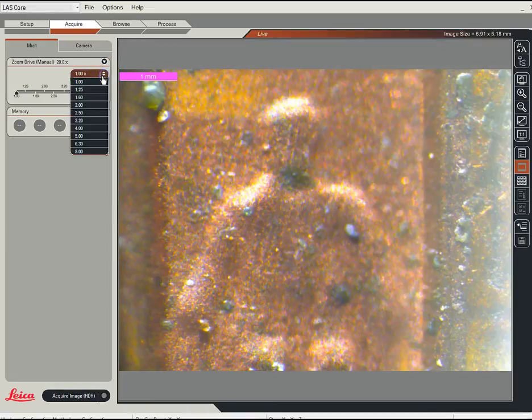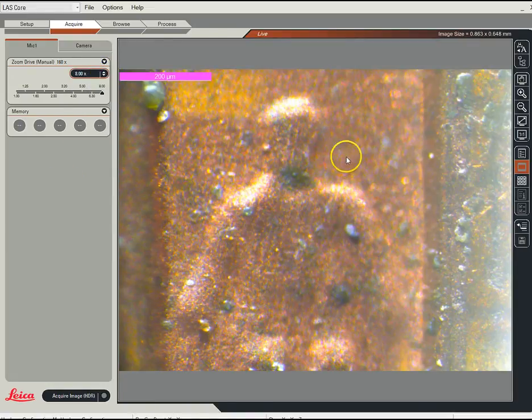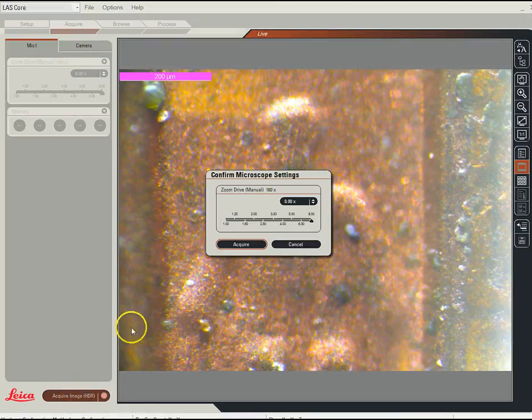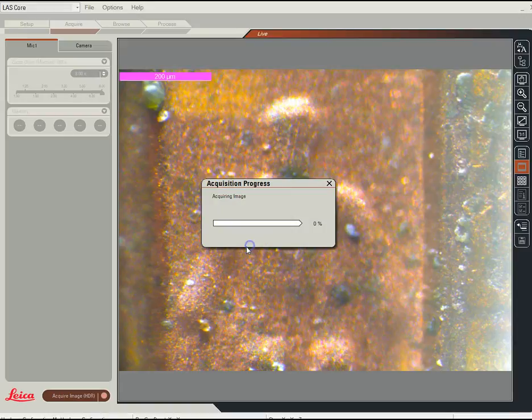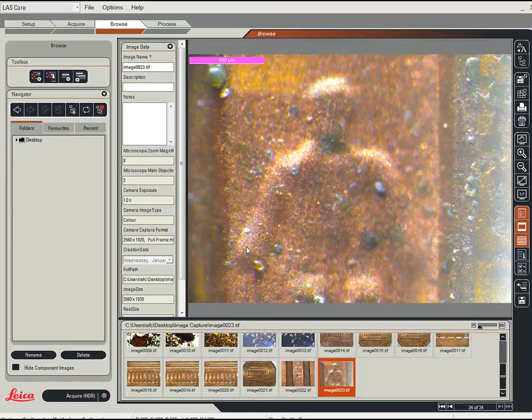I'm going to tell the computer that I'm using an 8x magnification — that's 200 microns there. Now again, you just come in and take the picture, acquire the picture. It double checks to make sure you have the zoom set, hit Acquire, and that picture should show up at the bottom of the image gallery.